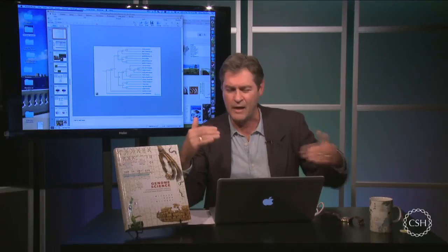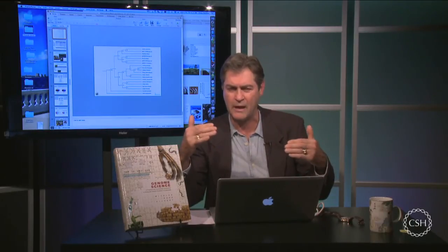Well, let's just assume that your primers are focusing in on the same region, because in fact, many times we use degenerate primers. We use a mixture. So long as those primers are amplifying the same region, you'll generate a barcode and you can analyze it nicely.